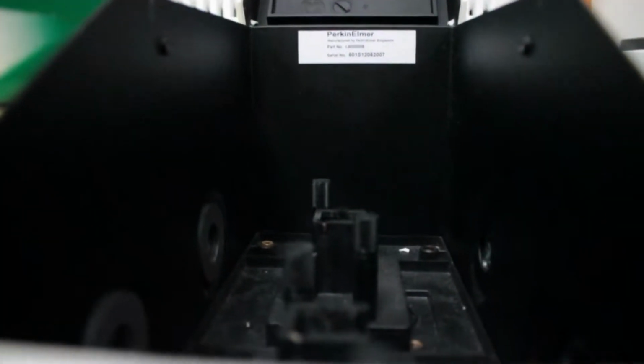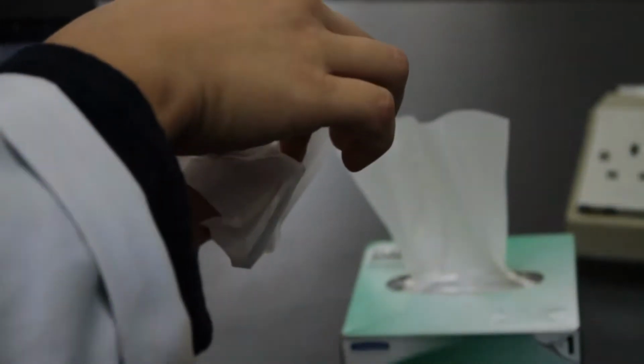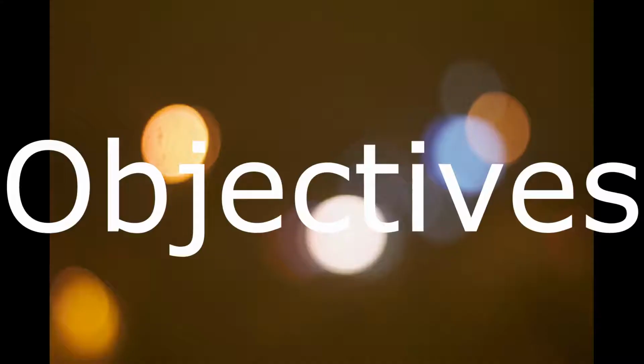The equipment that we are utilizing in this experiment is this UV-vis instrument. And here are the two cells that are used to fill our sample. But one thing we need to be cautious of is that we must wipe the surface of our cells before we place them into the cell holder so the results will not be interfered with.